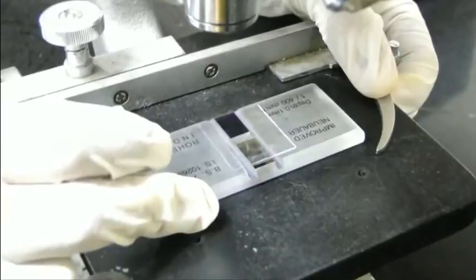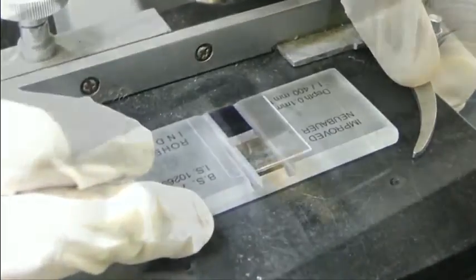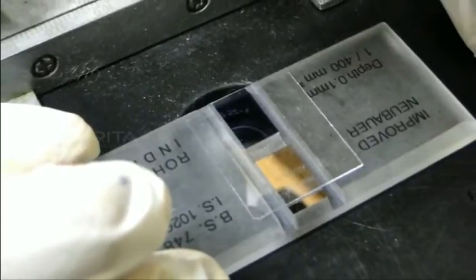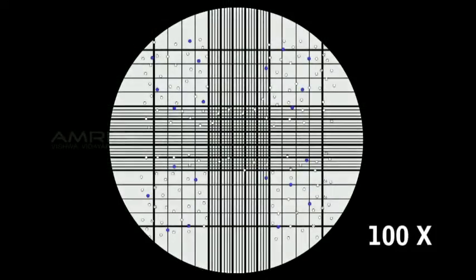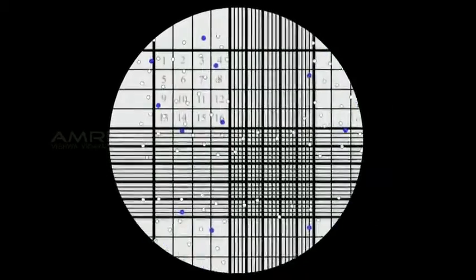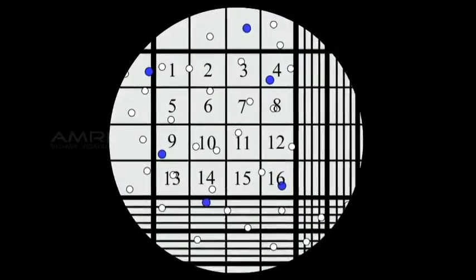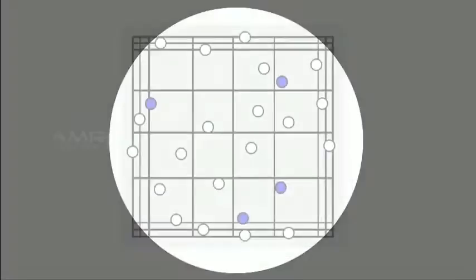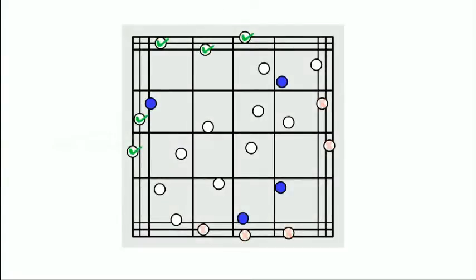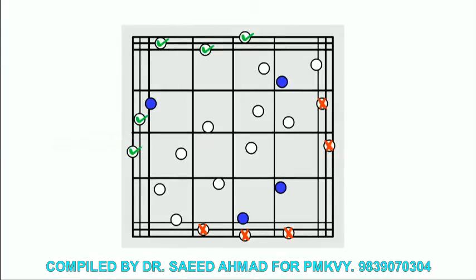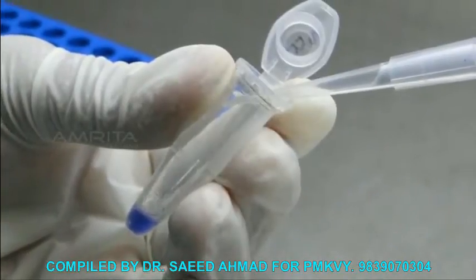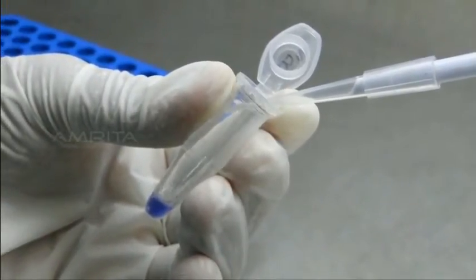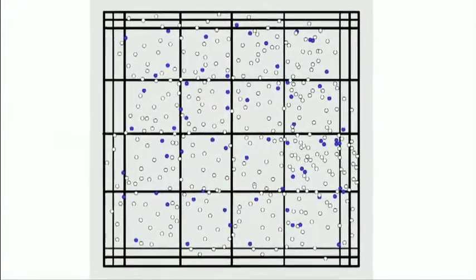Do not overfill or underfill the chambers. Now observe under phase contrast microscope at 10x, then view the cells under a microscope at 100x magnification. Under the microscope you should see a grid of 9 squares. Focus the microscope on one of the 4 outer squares in the grid; the square should contain 16 smaller squares. Count all the cells in the 4 one-millimeter corner squares. Include cells on the top and left touching the middle line; do not count cells touching the middle line at the bottom and right.